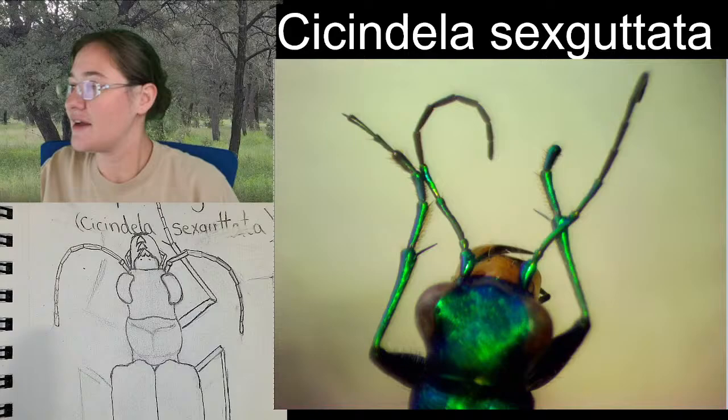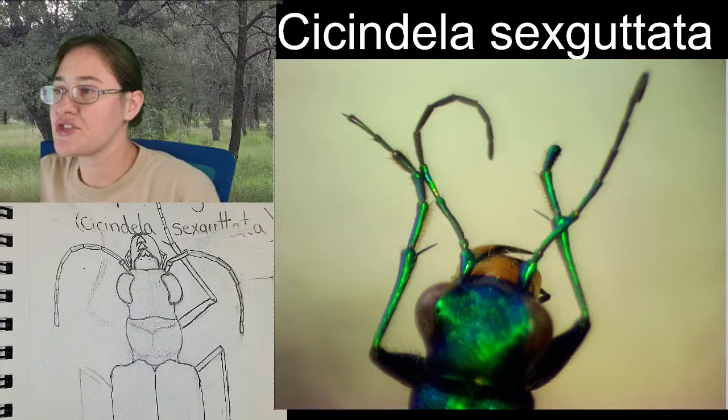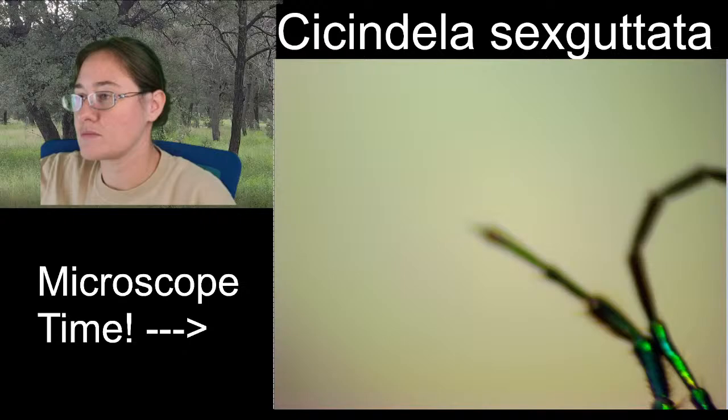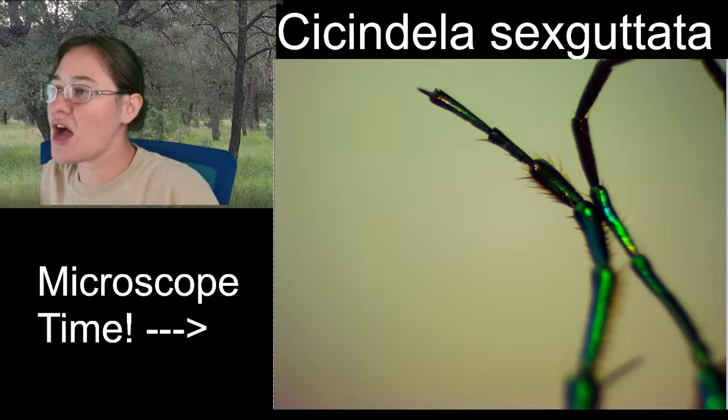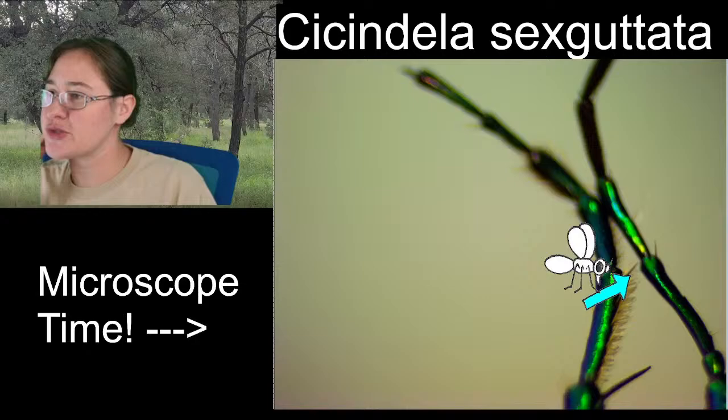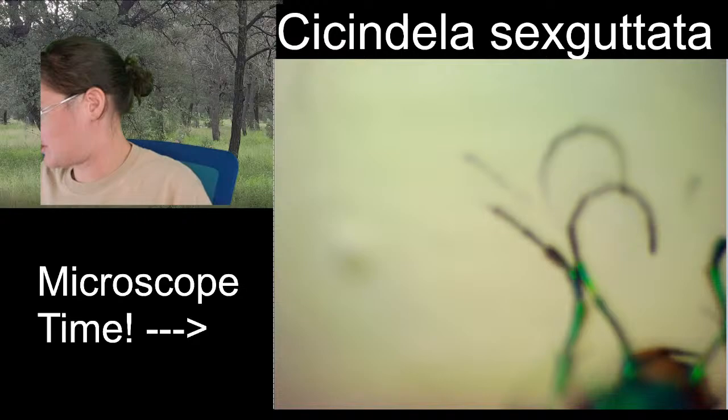Are those spines at the end of each tarsal segment too? I believe that the tarsal segments have little hairs. I wouldn't call those spines on the ends of the tarsal segments. I would call them hairs. Oh, check that out. Maybe there is one right here on the first tarsi. It looks like there's one spine here. So if you were looking at a middle leg, there might have been more spines on a middle leg.